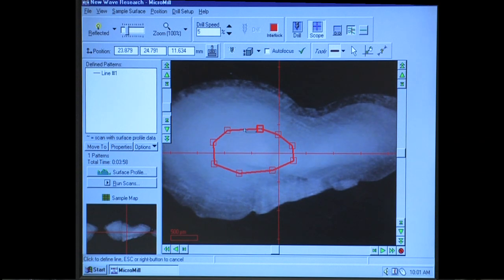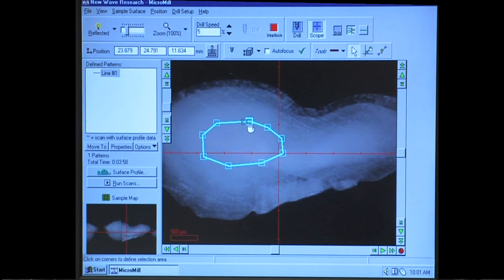If you should have to move a line or a point on your line sample, click on the arrow button on the menu bar in the top right of the screen. You can move the entire pattern by clicking on any point of the line of the pattern, or you can move individual points by clicking on the line's point squares.